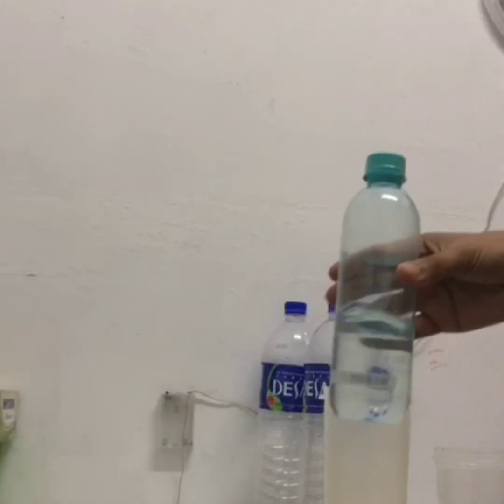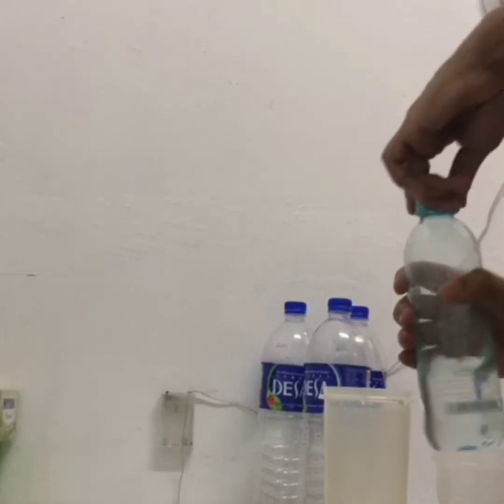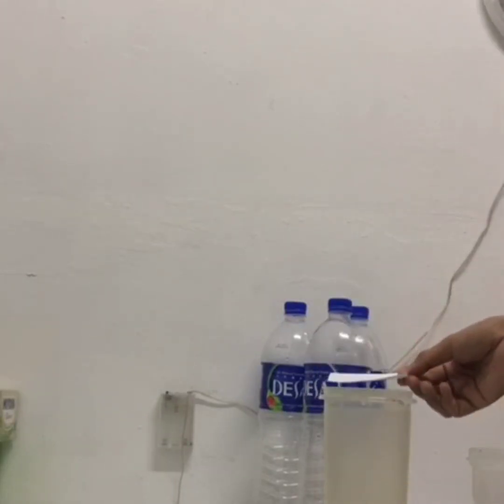First step is to shake the sample vigorously and transfer the predetermined sample volume to a graduated cylinder, as shown here. Next, place the pre-weighed filter in the filtration apparatus and wet it with a small volume of distilled water to fix it.